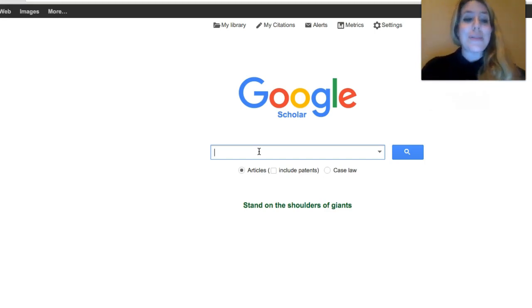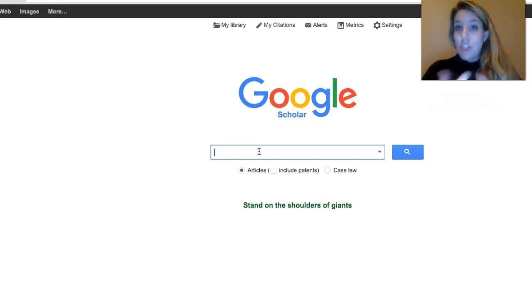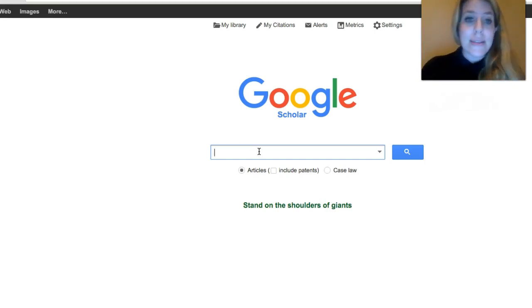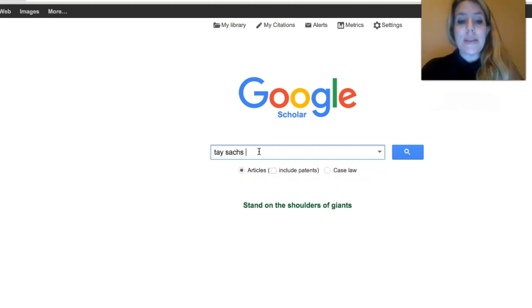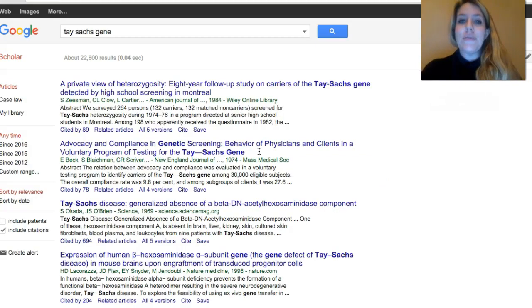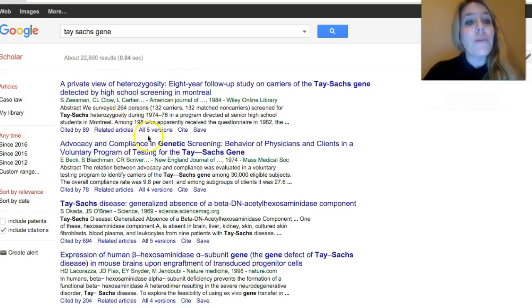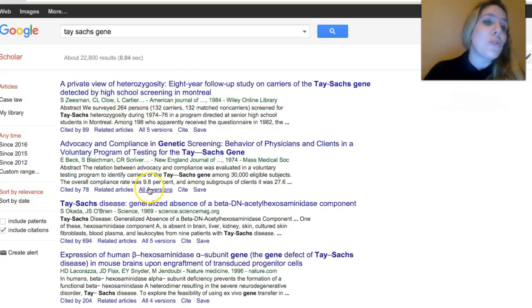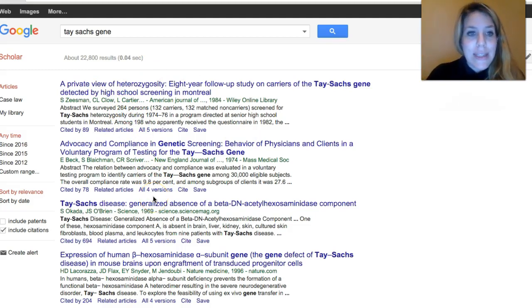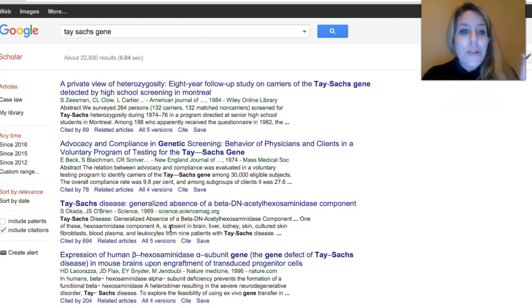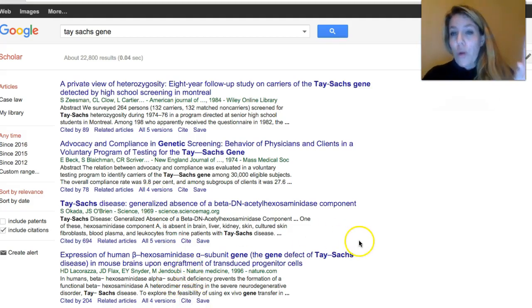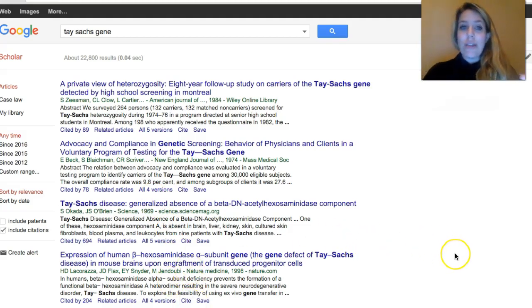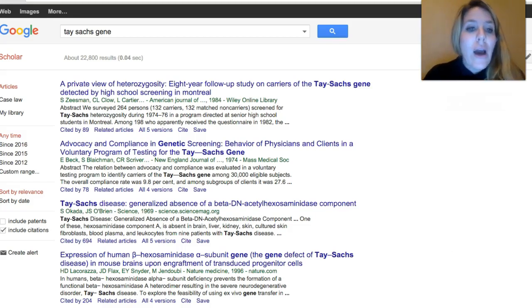Now what you're going to do is pick something you're interested in that has a genetic basis and has been worked on by genetics labs. For example, maybe you're interested in the gene that causes Tay-Sachs disease. I could put Tay-Sachs, that's the name of the disease gene, and hit return. You'll see references to peer-reviewed scientific journal articles that have studied the Tay-Sachs disease.